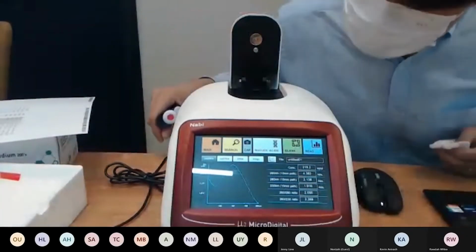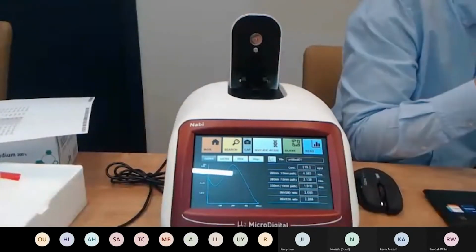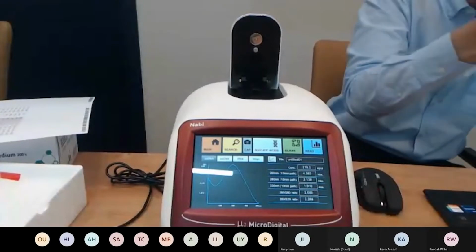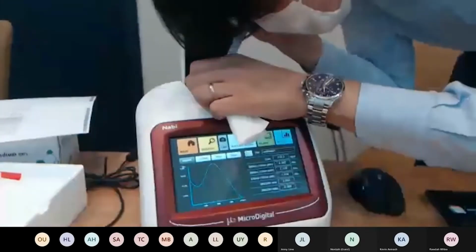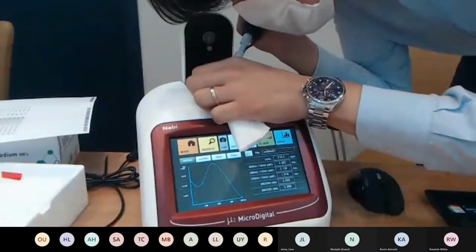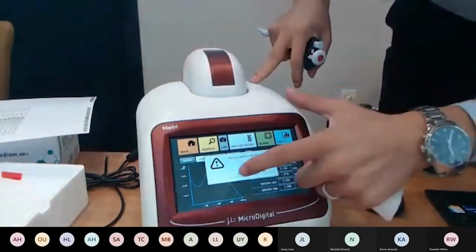So as you can see, if the result is not what you expect, it's very simple, it means I did the blank wrong. Sorry, I need to actually stand up and do this. Otherwise, it's a bit uncomfortable. So blank again.